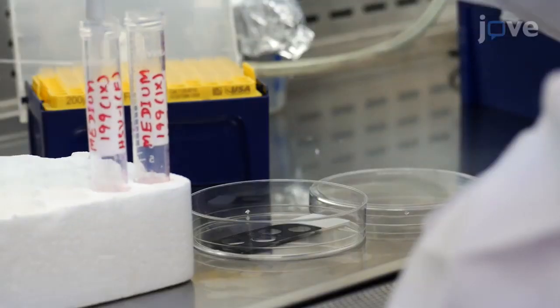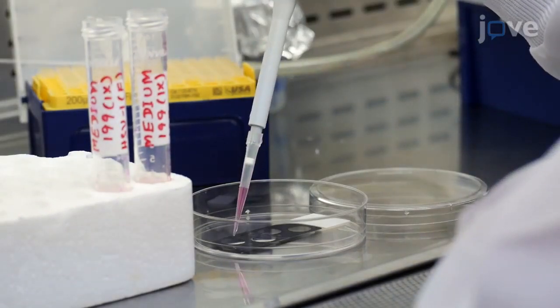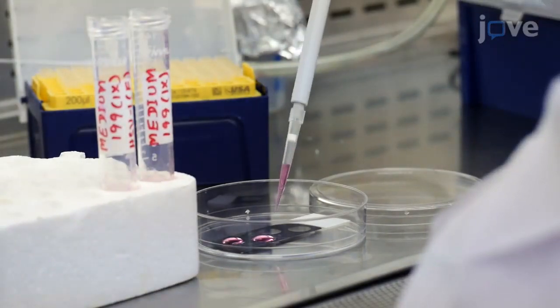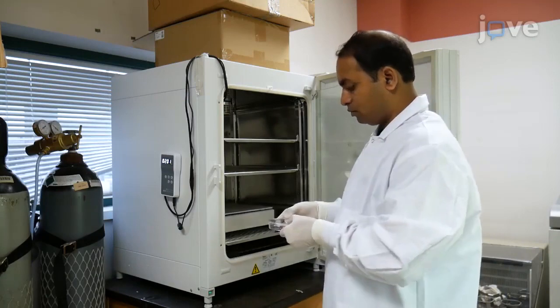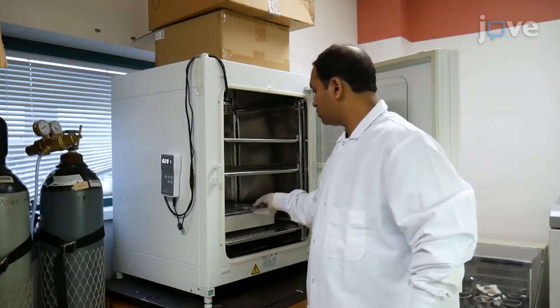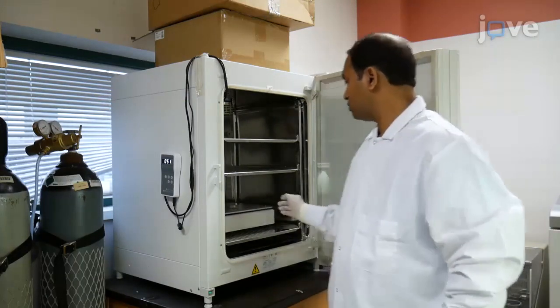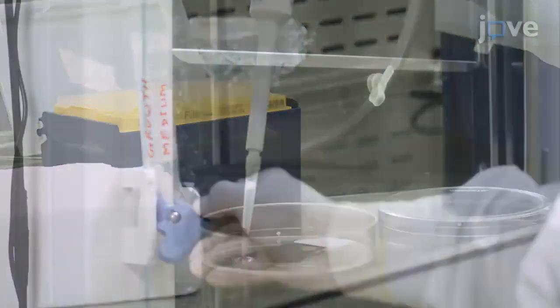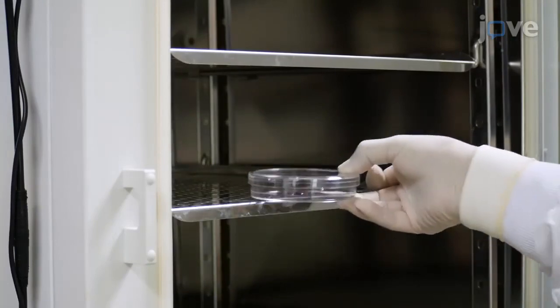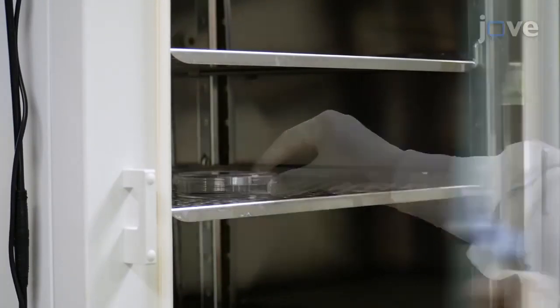The next day, replace the supernatants of the 70 to 80% confluent cultures with medium 199 containing 4 to 10 plaque forming units per cell and place the slide at 37 degrees Celsius with shaking for 1 hour. At the end of the incubation, replace the supernatants with fresh growth medium and return the cells to the incubator for the appropriate experimental infection period.